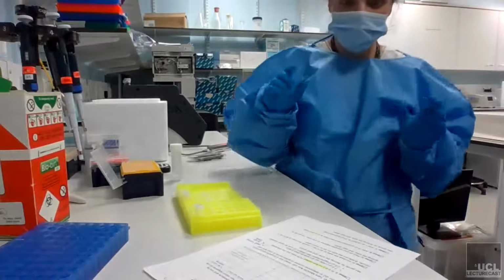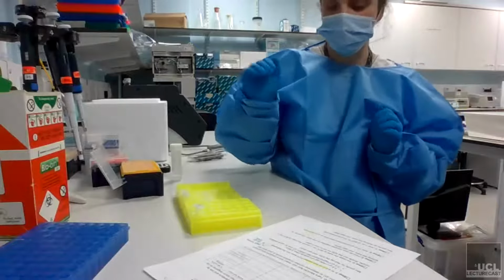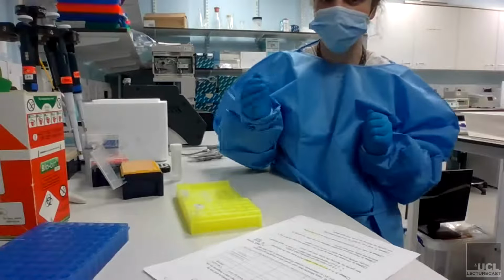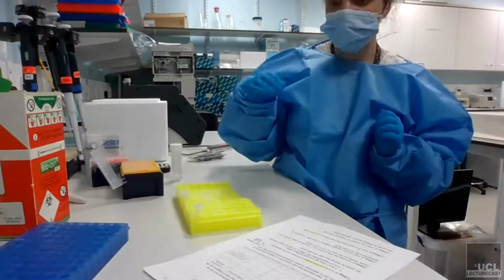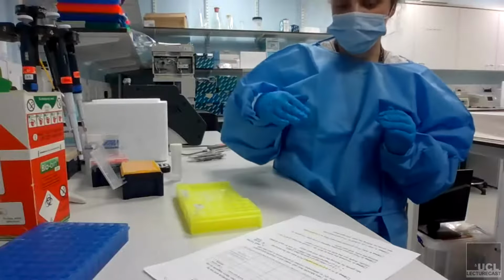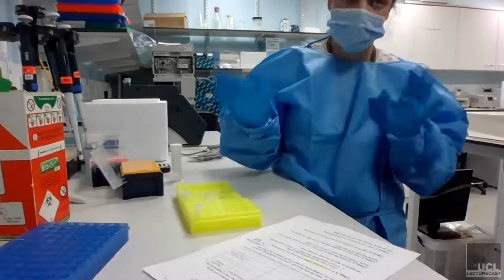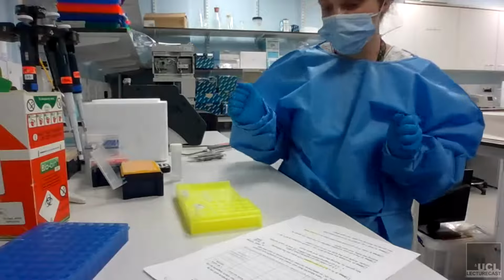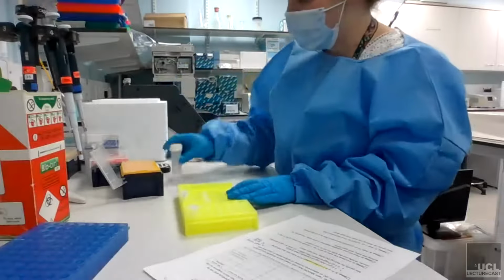What I usually do is work this out. Usually the Qubit is the most accurate representation of concentration, I find. So I tend to use the Qubit's suggestion. And then, as I say, dilute them down with the appropriate amount of water to get about 53 nanograms per microliter. So I'm going to pretend to do that now.